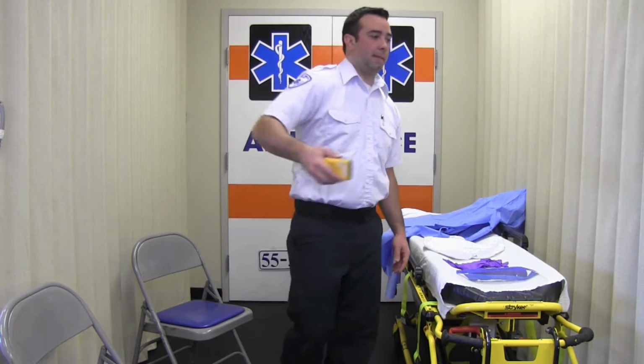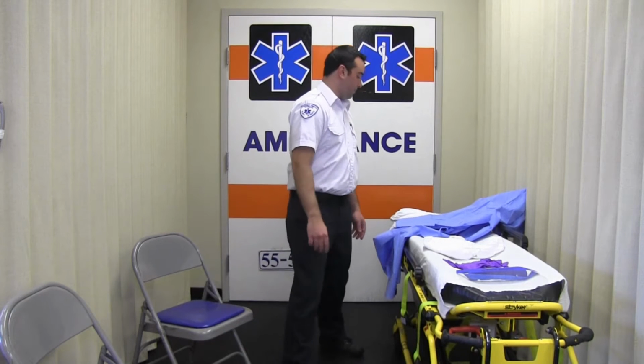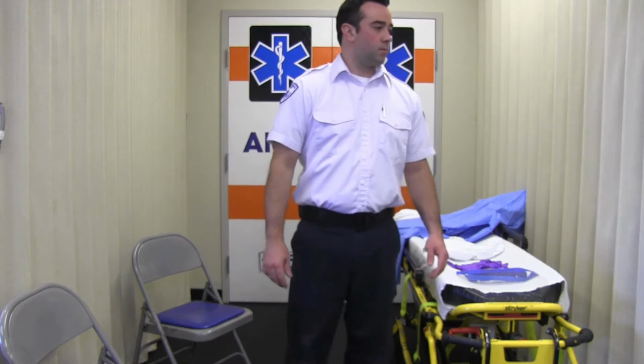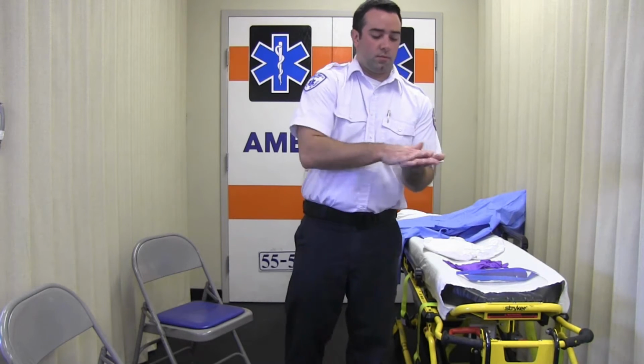The first step is to remove personal items such as jewelry, watches, and pagers prior to donning PPE. Then you will visually inspect the PPE to ensure it is in good condition and all required equipment is available. Now perform hand hygiene with an alcohol-based hand rub, allowing your hands to dry before moving to the next step.